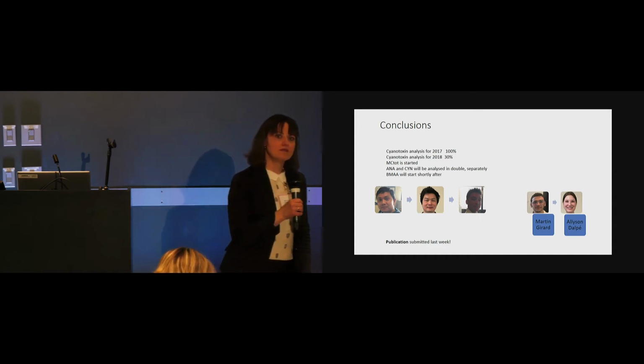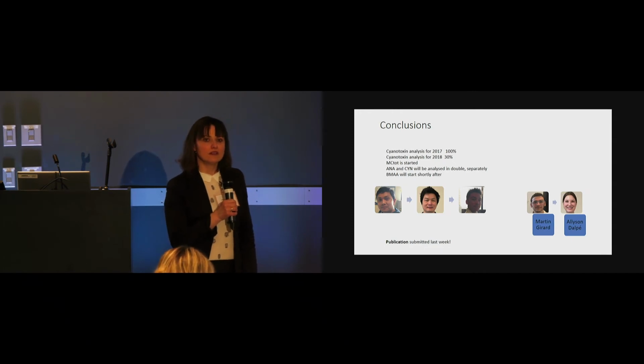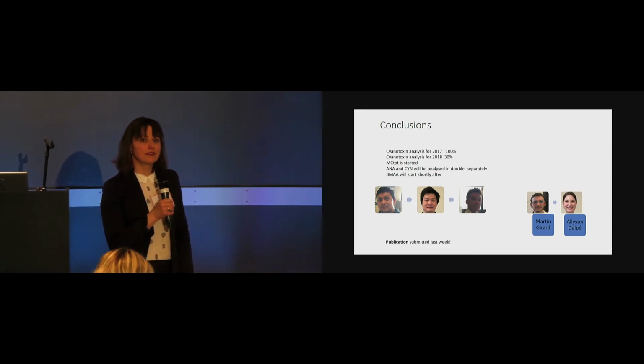Just adding on that, at Poly we have some ELISAs. The samples we do on oxidation, we actually run on ELISAs, and then the samples will go to UdeM. So those samples will provide the opportunity to compare the ELISA and the analytical methods, and we use higher toxin concentrations. So it will be directly done once the Polytechnic samples are analyzed in your labs, because we have exactly the same samples run on ELISA.